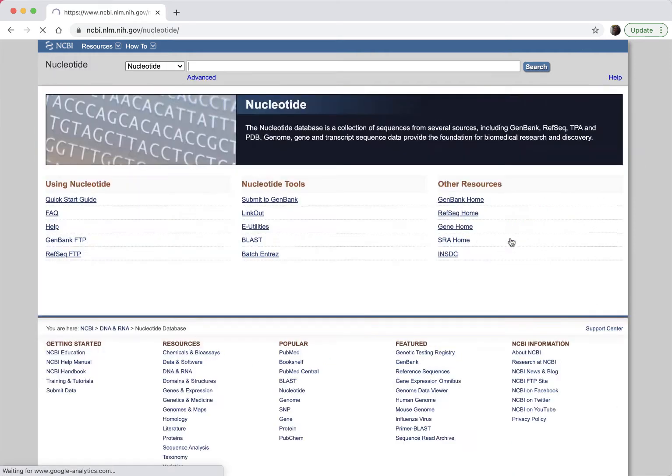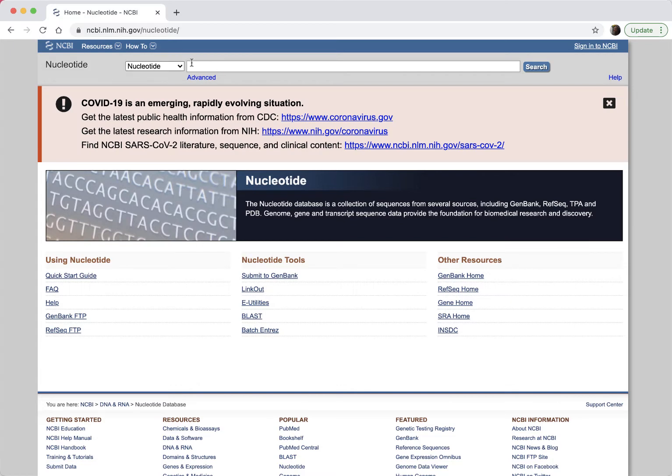I've got it set to nucleotide. So if you click on nucleotide, it'll tell you that you're searching for nucleotide sequences. I did this because most of the information that's there, I think, is in nucleotide sequences. There are a few sequences in the entire collection that go in different directions, like whole genomes, or protein sequences, the amino acid sequences of proteins. Let's just keep things relatively uniform, and because it's a pretty broad net, we can all use nucleotide-based sequence searches for this exercise. Okay. And so what I'm going to do here is just type in the name of an animal that I've chosen.